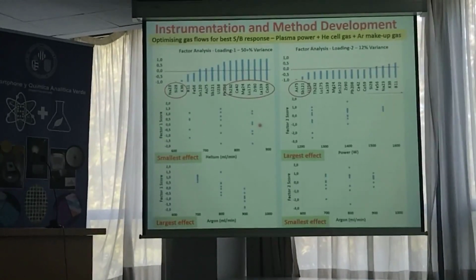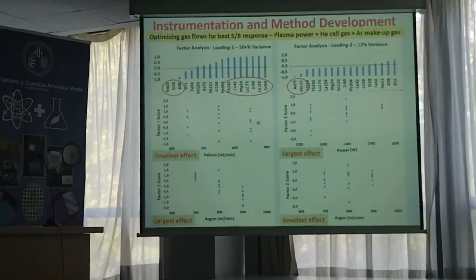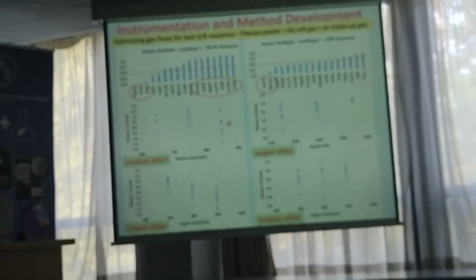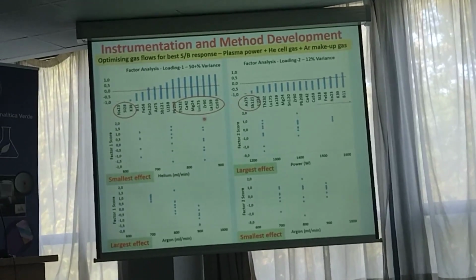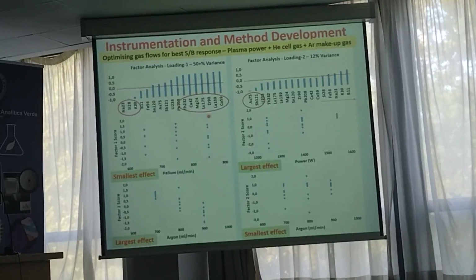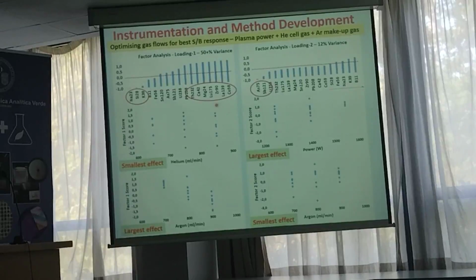With all instrumentation, you are always making compromises. Many times people want to analyze as many isotopes and elements as possible, so maybe 40 or more. But each of those has slightly different properties in the mass spectrometer, and optimizing for them can be quite difficult.